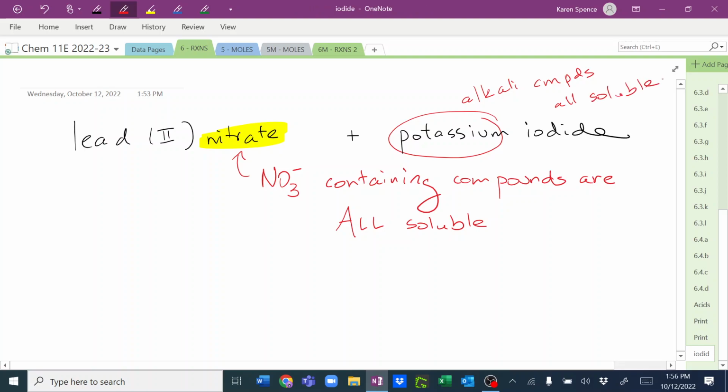Okay, so you're going to write your reactants and you're going to predict your products, yes? There's water here, but it does not take part in the reaction. And I'm just going to go grab one more thing so we can do something a little bit fun with this.